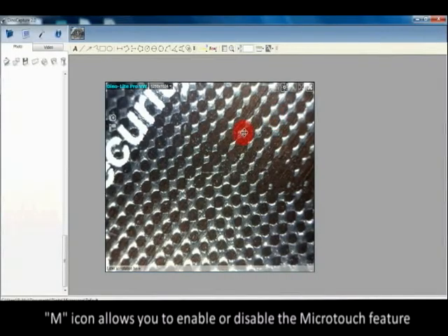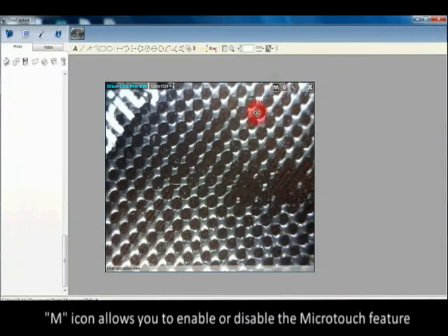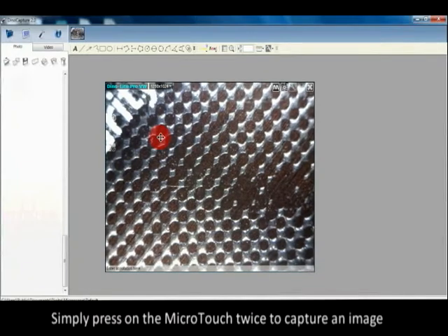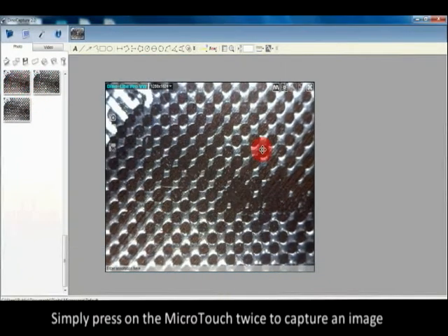The M icon allows you to enable or disable the micro touch feature. Simply press on the micro touch twice to capture an image.